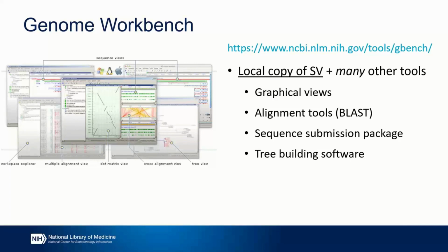For example, the Workbench offers many different graphical views, including several for viewing multiple sequences at a time, like multiple sequence alignment viewers and a phylogenetic tree viewer. Or you can even view individual sequences, like exploring their feature tables and seeing all their annotations. And even just some generic views, like exploring data tables or just sequence and text. Genome Workbench also offers several analytic tools like BLAST or MAFFT, so you can actually generate some of the data that you intend to visualize in Genome Workbench.